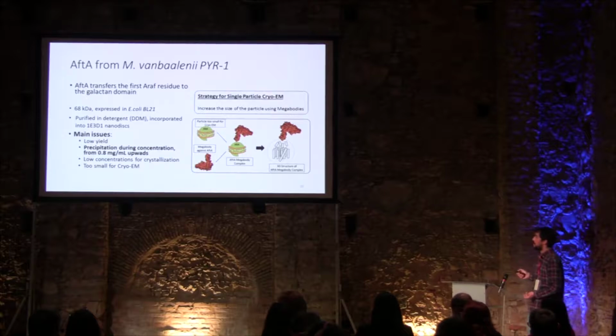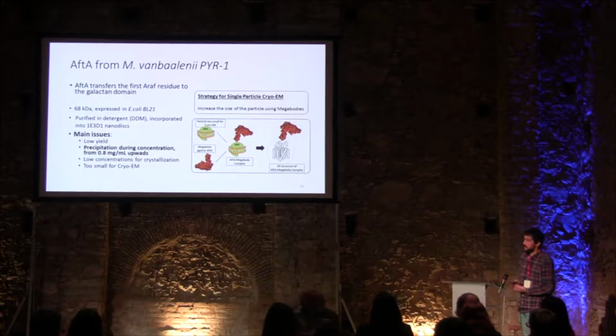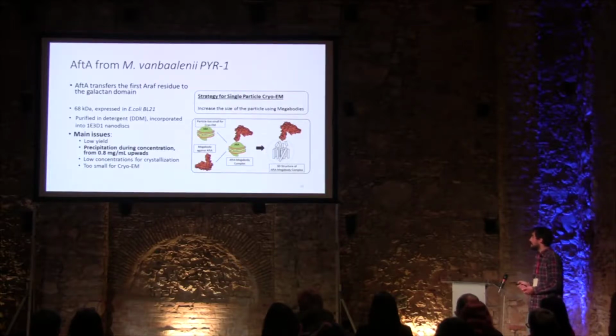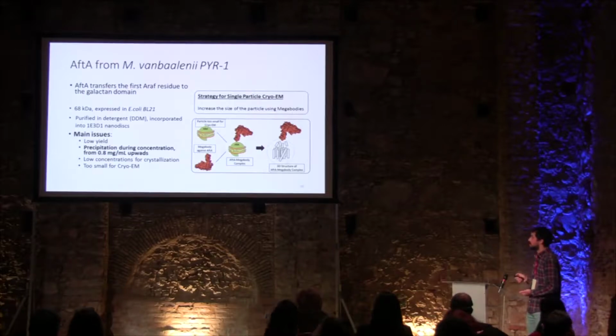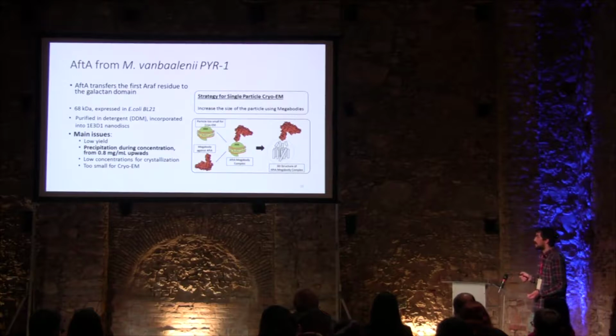We purify in the same manner. We purify in detergent and incorporate it into nanodisk. However, the problem with this particular protein, despite the low yield, is common to every single membrane protein that I work with. We had problems with concentrating this protein, so it precipitated a lot. So we couldn't reach the concentrations suited for crystallization, and the overall size makes it too small for cryo-EM.